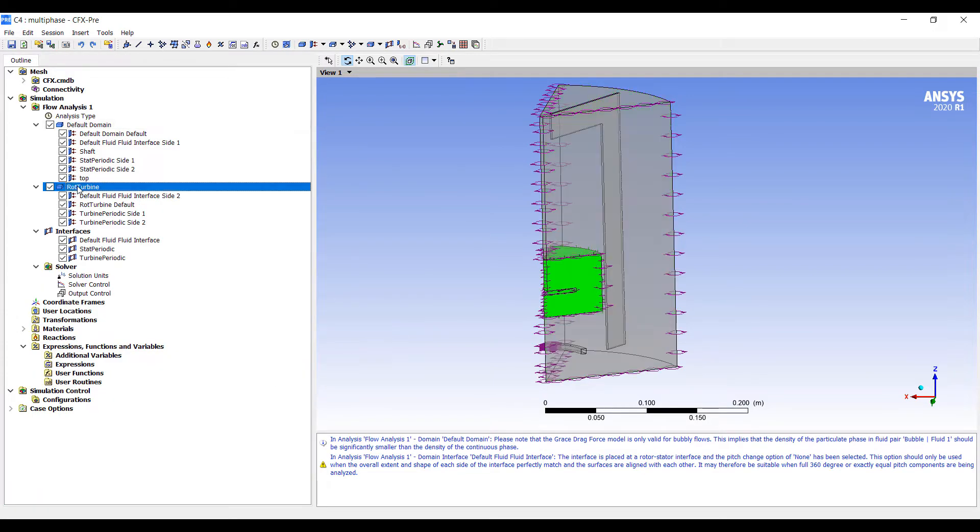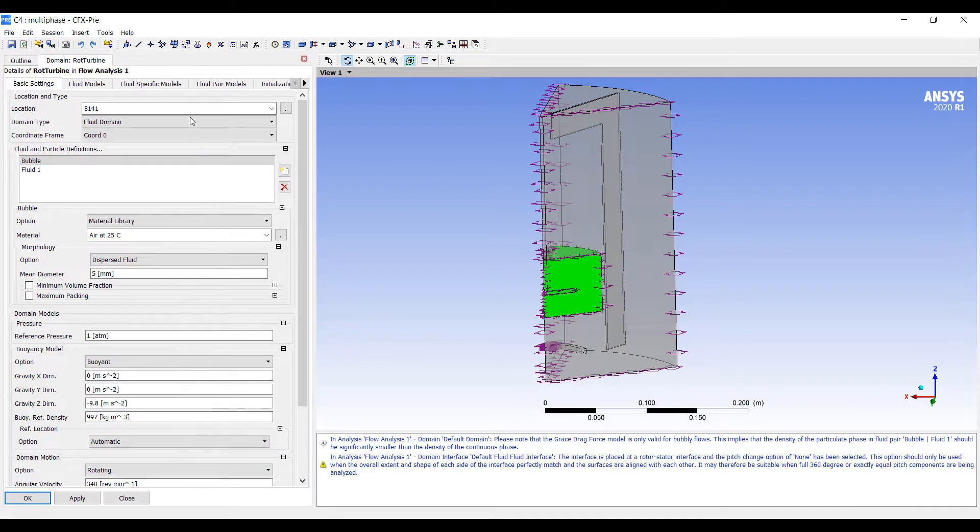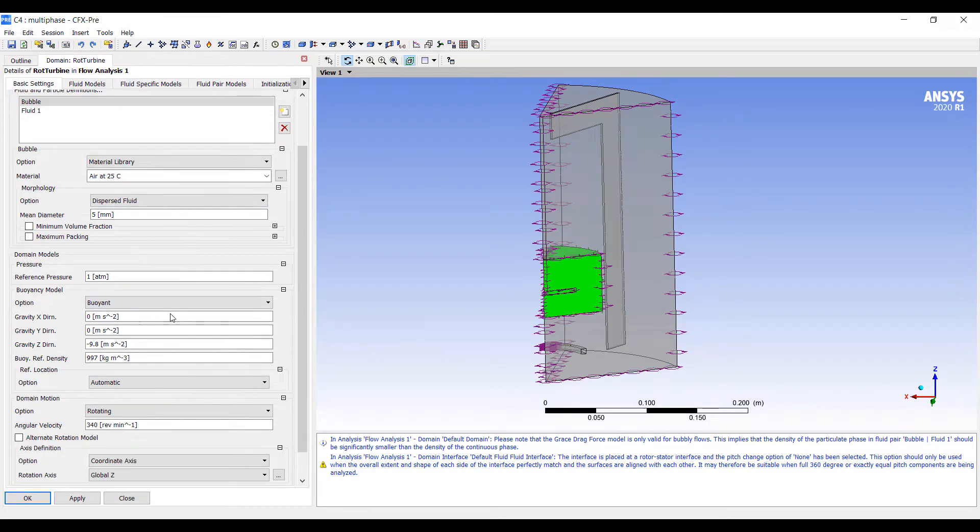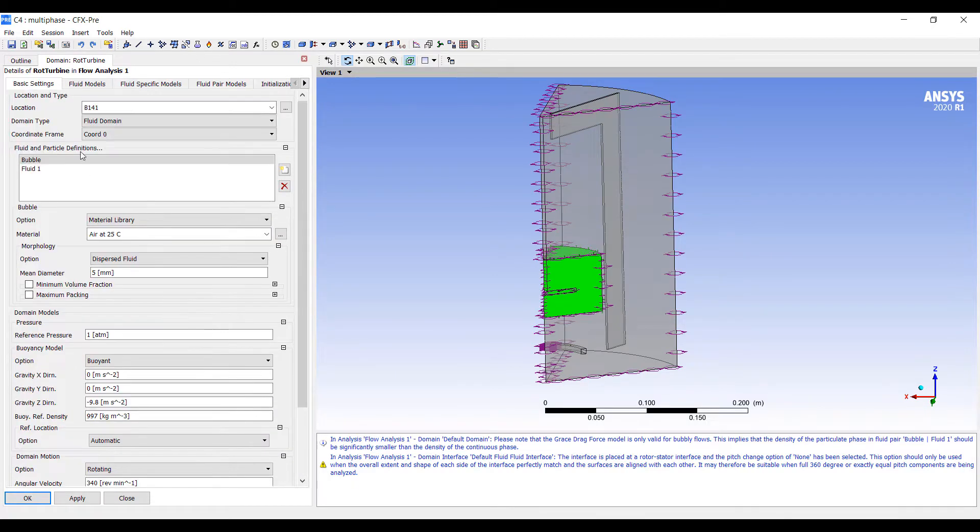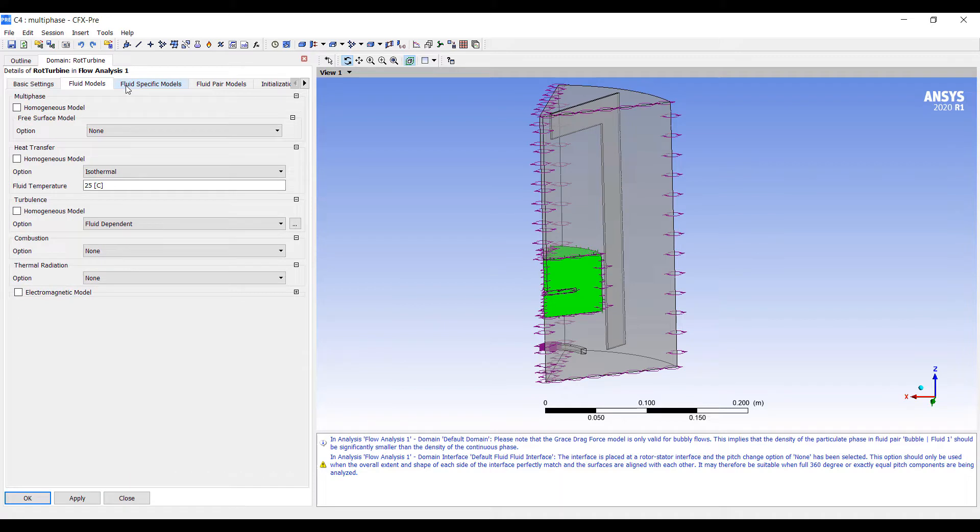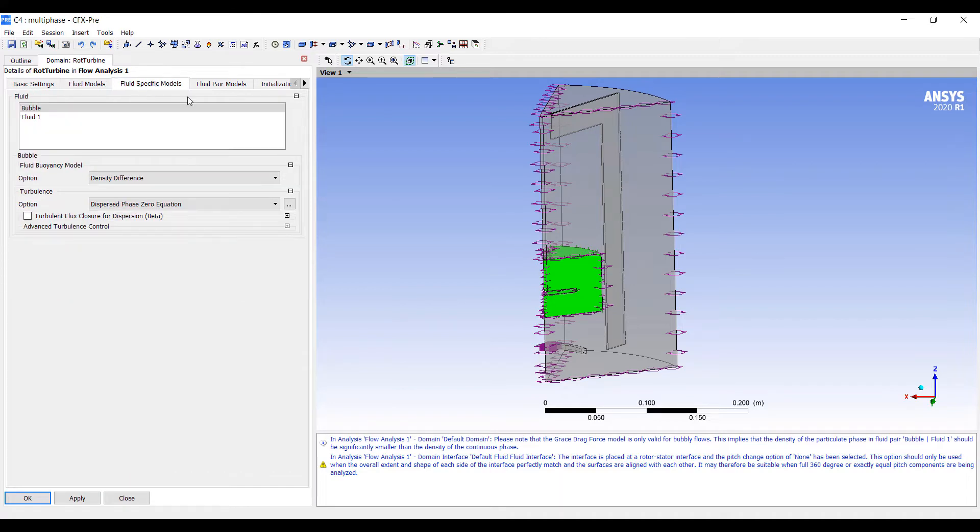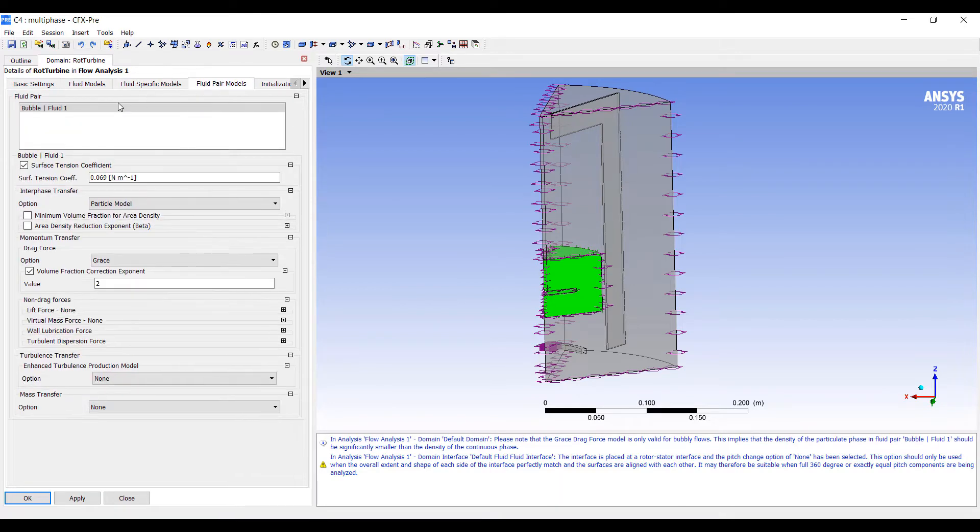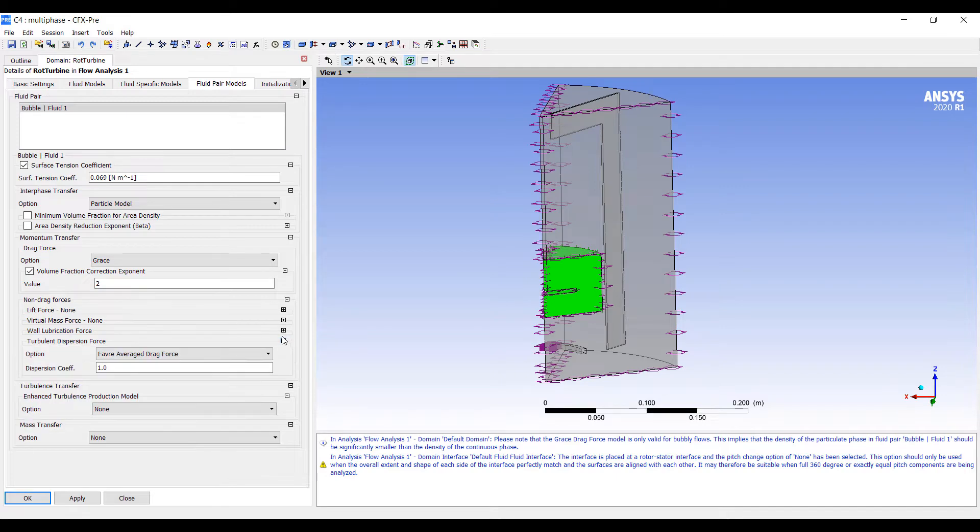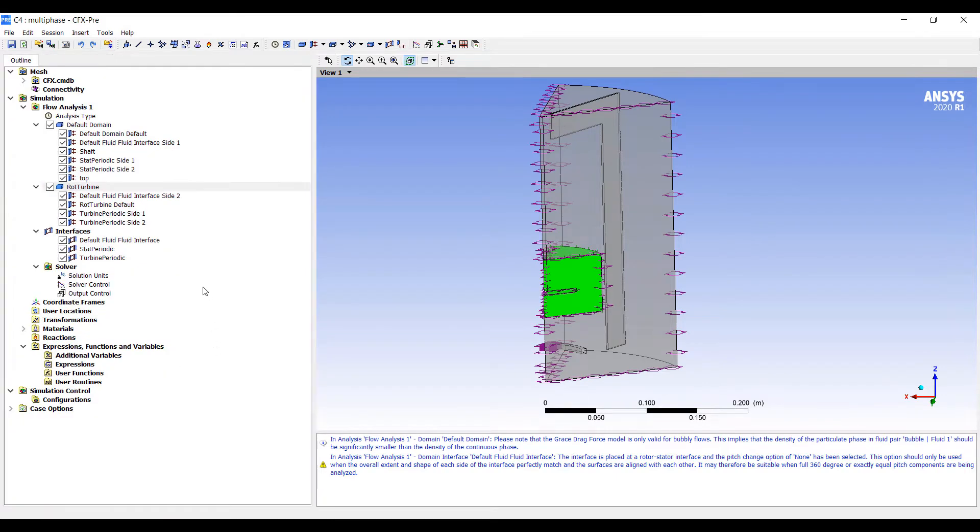For rotor side, it should be the same. You can see that once we start changing the model in one domain, the other domain kind of follows suit and has the same type of information. This is all we need for now.